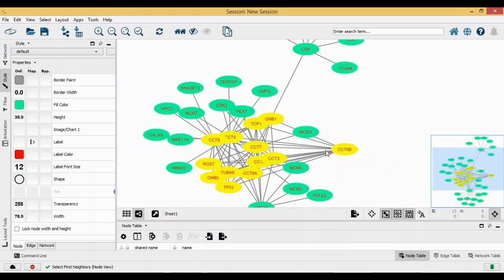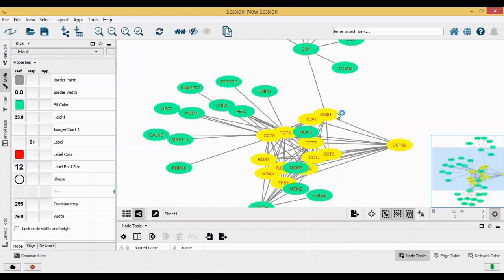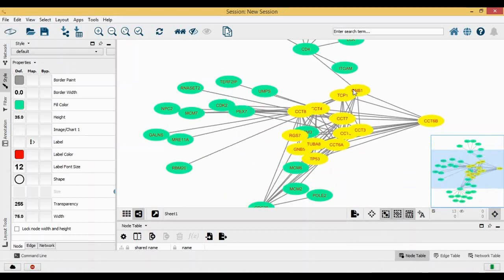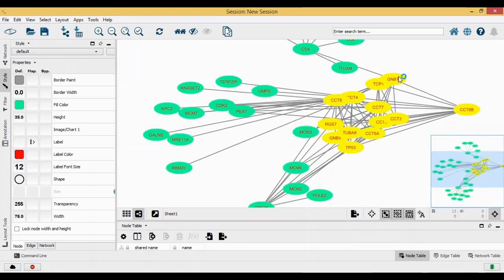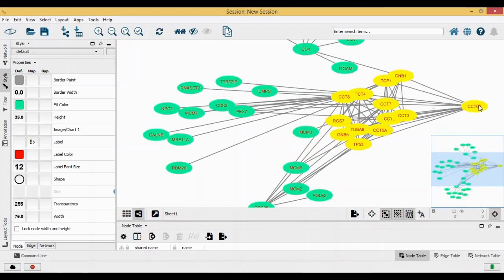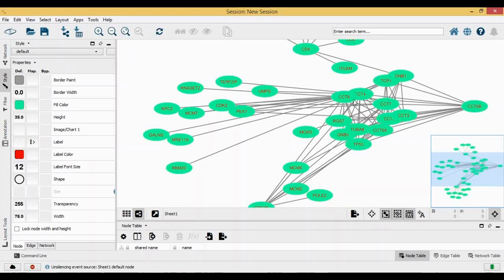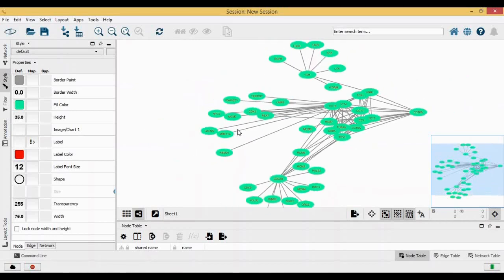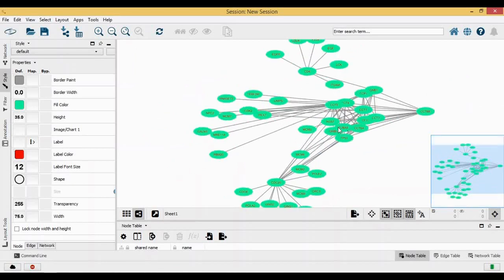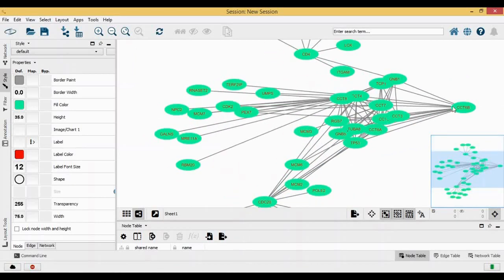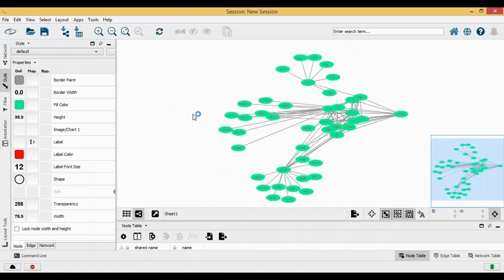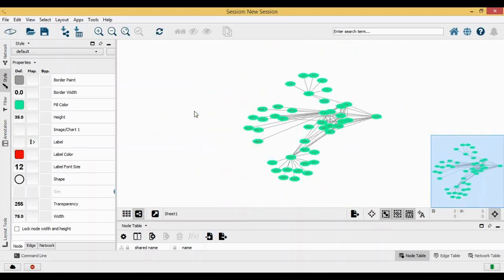When I click on select first neighbors, can you see the ones which have been highlighted here? These are all the genes which are actually having an interaction with this hub gene. This is how it is very easy to know which all genes are carrying out interaction with your target gene.